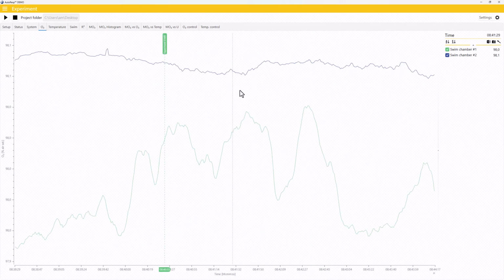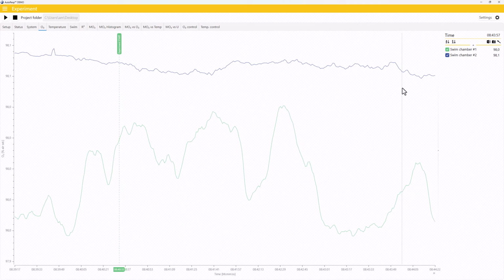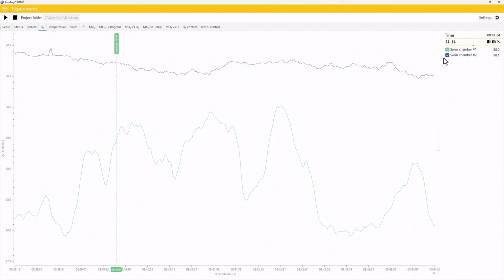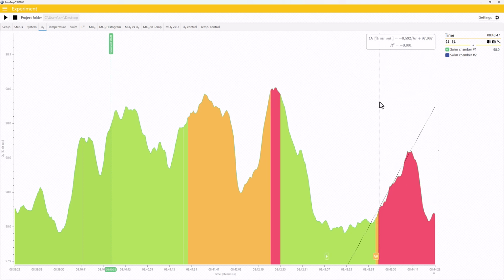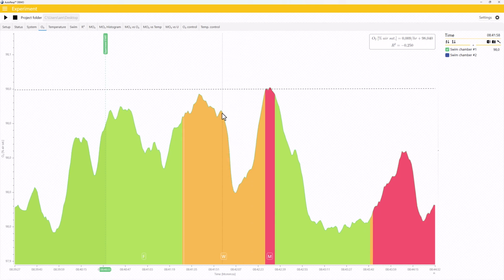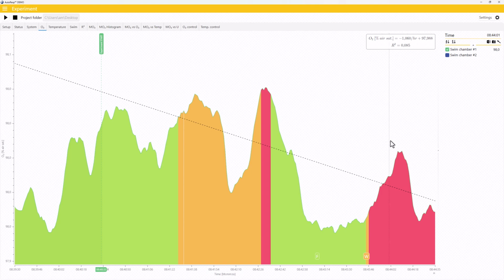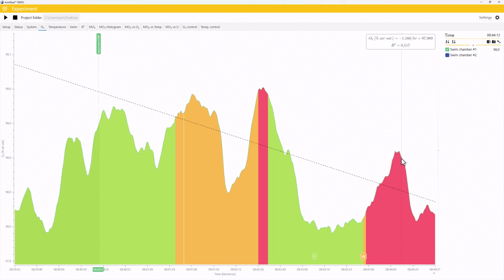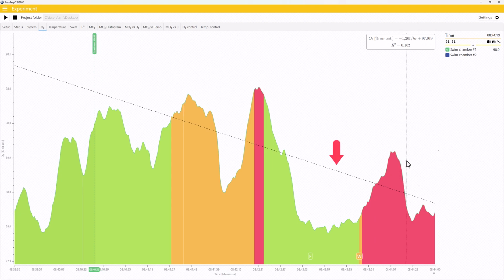If you want more details about your experiment data, you can have a look at each of the data tabs. You can interact with each graph, and you can select which data channels that you want to see. Notice that additional visual information is displayed on some of the graphs when only a single channel is selected. As an example, selecting a single swim tunnel in the oxygen graph now shows you which phase we are currently in, and for the red measurement phase, you can even see the regression line and equation.